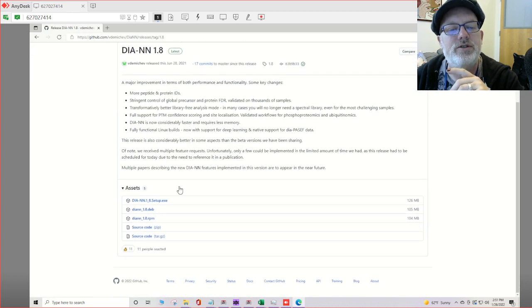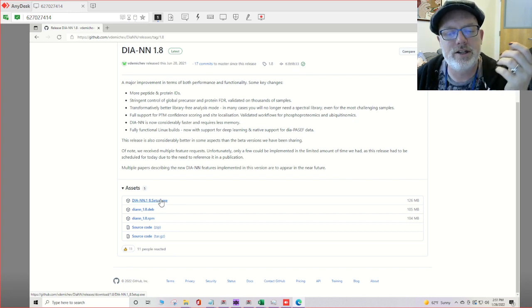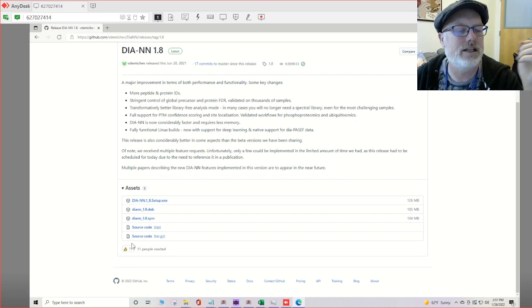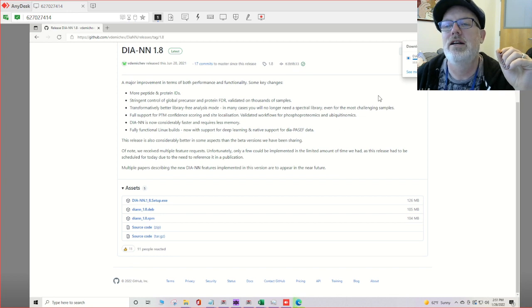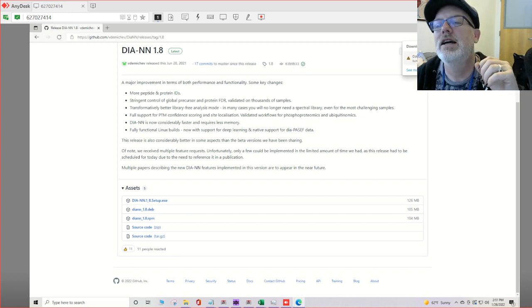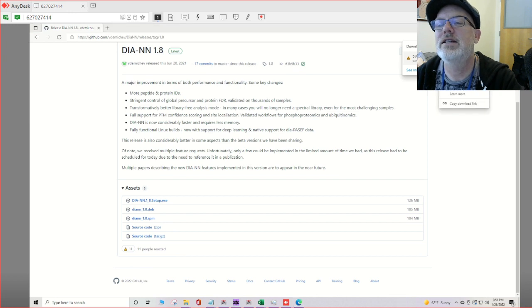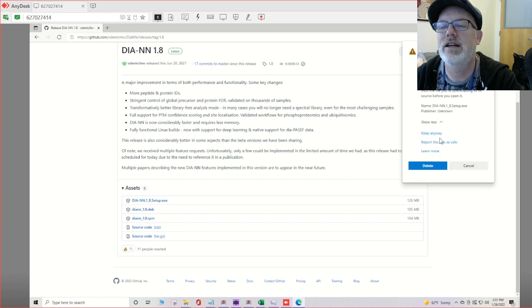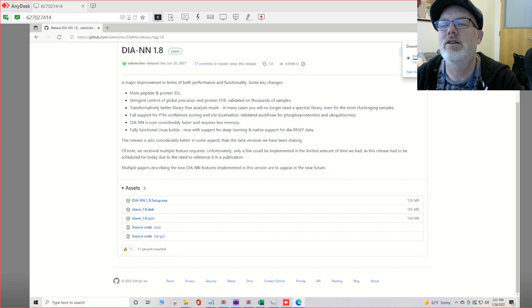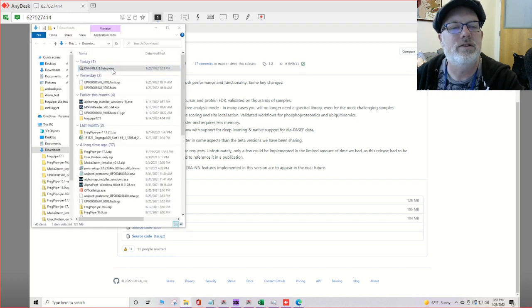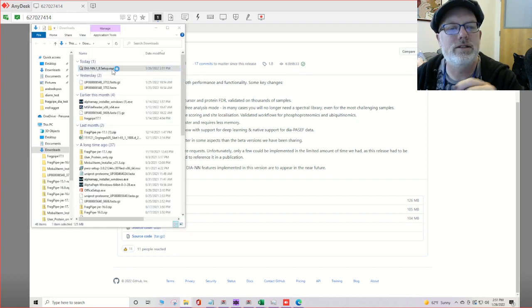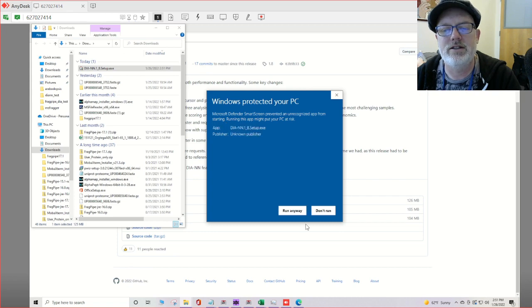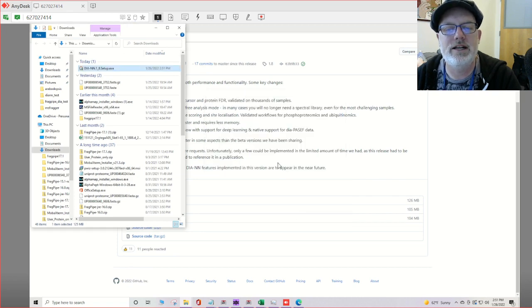And choose the exe if it's Windows. Just click on it and it will download. It only takes a second. It's usually complaining about if you want to trust it. We'll install it. It'll give us some warnings. We'll hit run anyway.